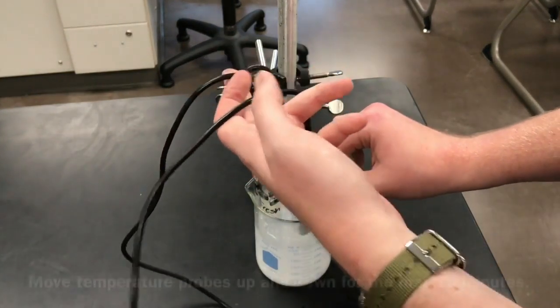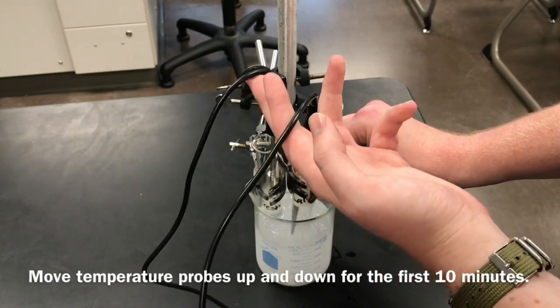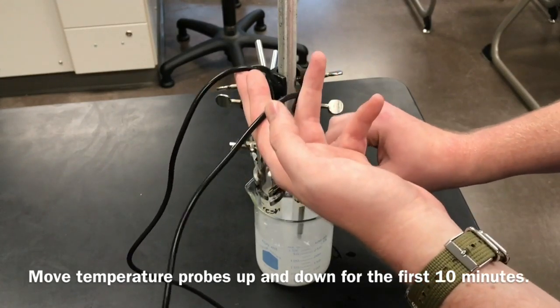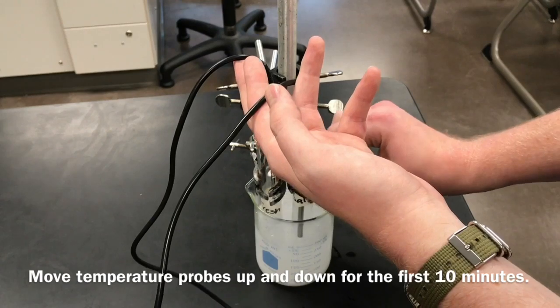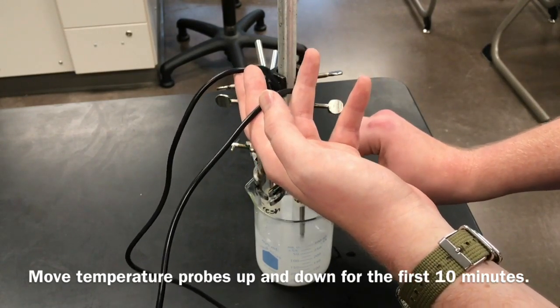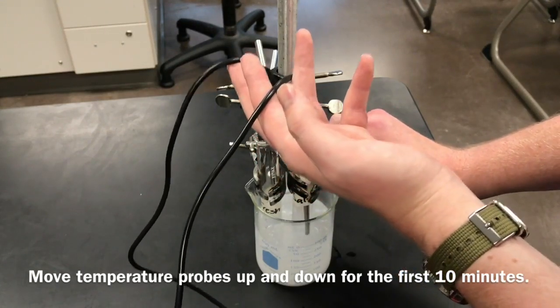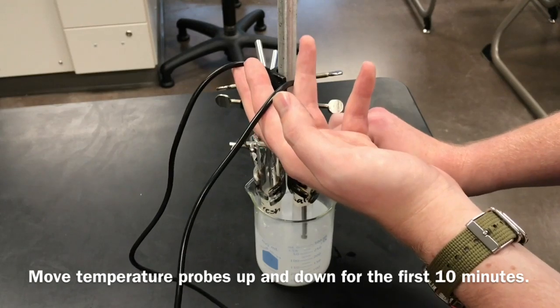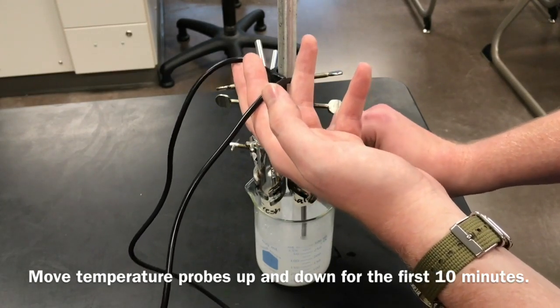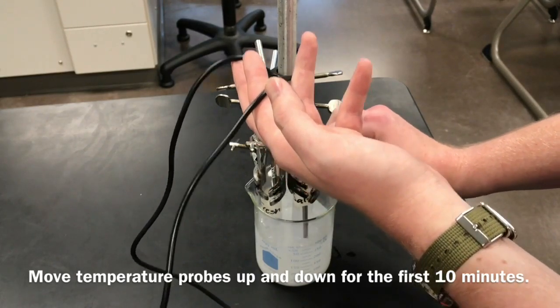The other partner, I just want you to carefully move the temperature sensors up and down. We're not going to do this for the entire time. You're going to stir your salt water for about 15 minutes, and we're just going to bob these temperature probes up and down for about 10 minutes. So 10 minutes of the trial. We'll come back in 10 minutes to see what we do next. But you're going to be doing both of these things for the first 10 minutes here.